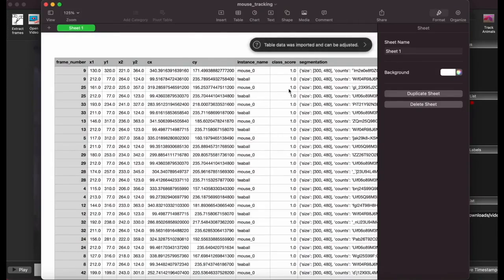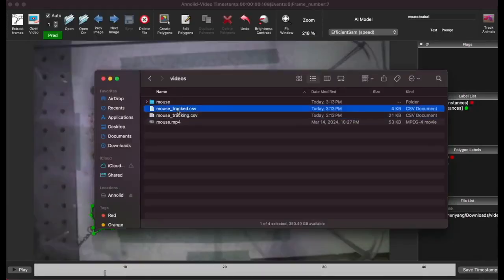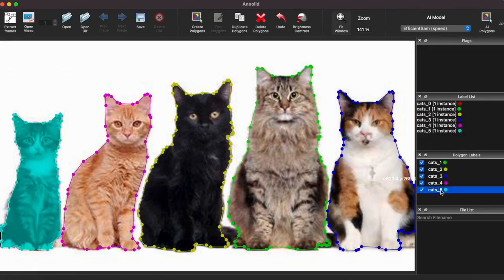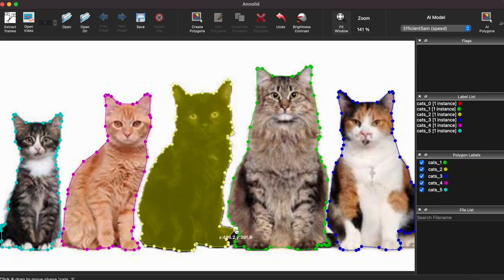It is, and it's come a long way. Early versions of Annolid relied heavily on researchers manually drawing outlines around each animal in every single frame of video. That sounds incredibly tedious. Oh, it definitely was. But that's where the AI advancements really shine. Now, Annolid uses models like Cutie and Grounding DINO to do a lot of the heavy lifting automatically. All right, those are some pretty interesting names. Can we dive into what those models actually do?